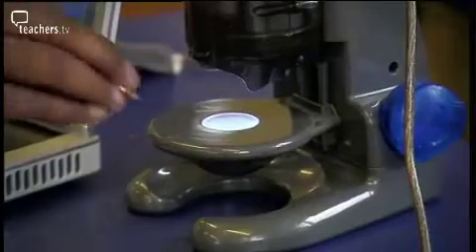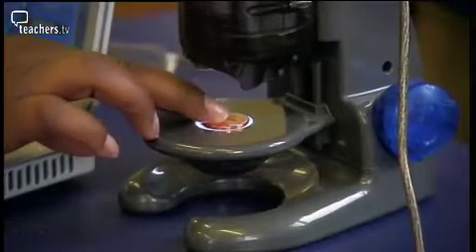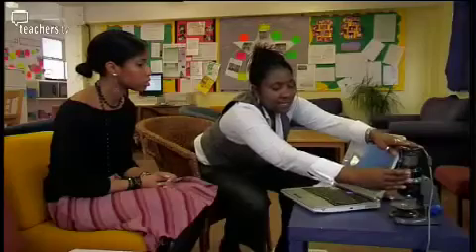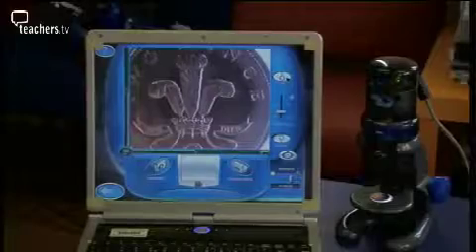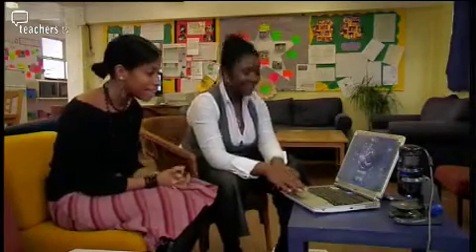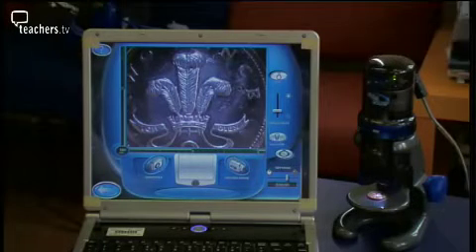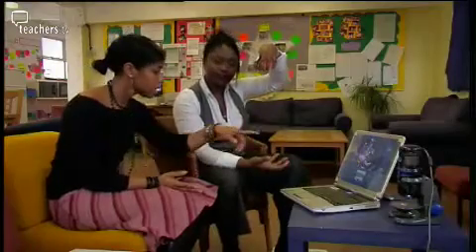Right. 2p. I am going to just adjust it to the lowest setting, which is 10 times magnification. This is the software interface. Basically, it helps you to control it, and it makes funny noises as you mouse over the various bits. The children like that. This icon is for the top light, so you can actually arrange it so that the light is on top of your subject. Is that the light that's showing at the moment? That's the light that's showing at the moment.